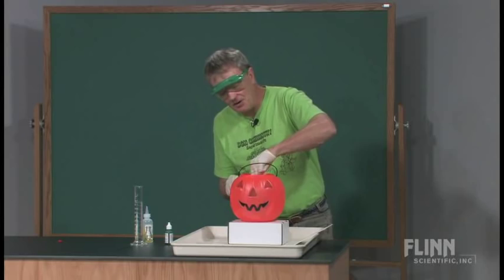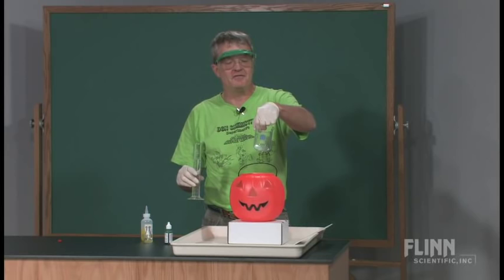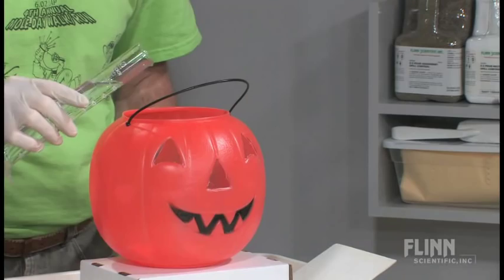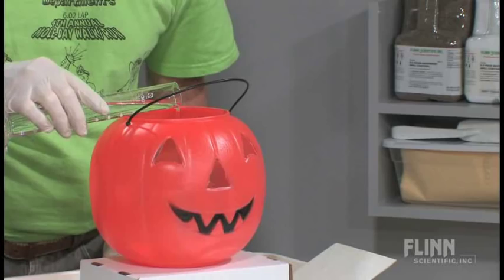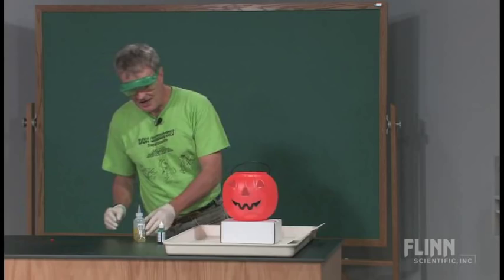Down inside the pumpkin right now I have a beaker — it says 250 milliliters on the front. I'm going to dump into it 100 milliliters of hydrogen peroxide, so I'll pour that down in there carefully. It falls into the container, and I'll set my graduated cylinder off to the side.